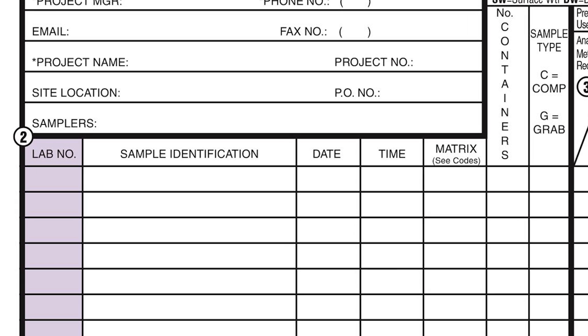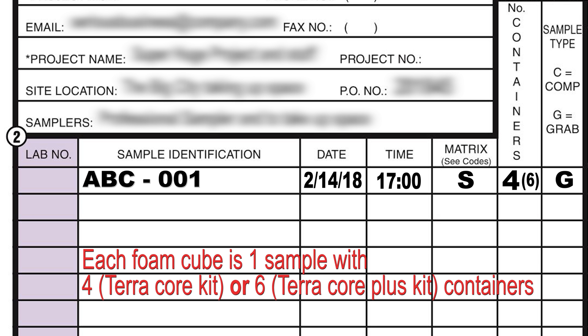When you are ready to fill out your chain of custody, each foam cube represents one sample with four containers each.